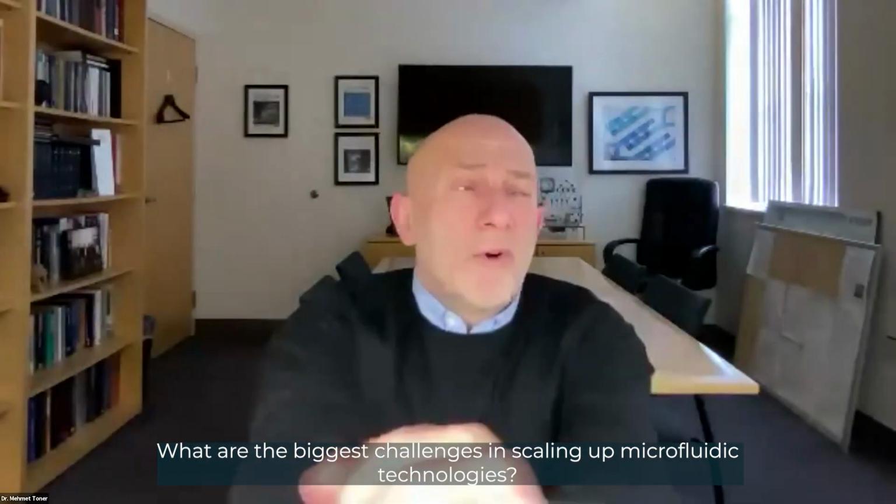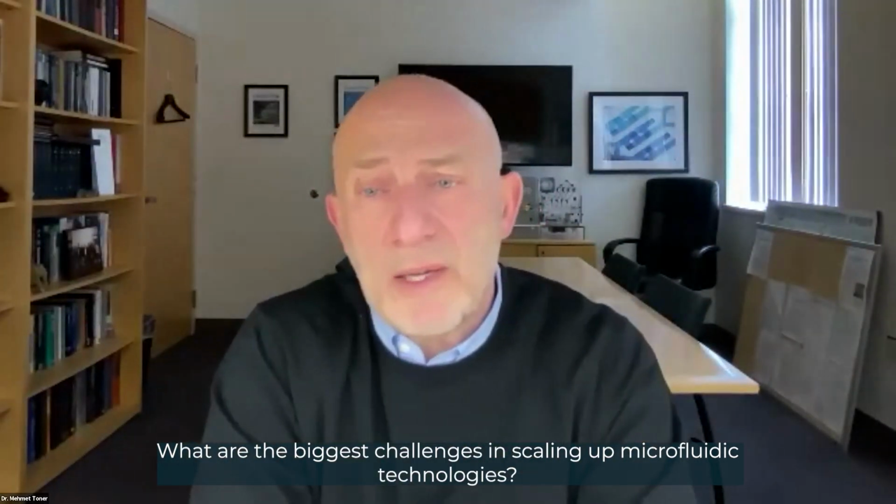Yeah, for example, the complex chip I showed you, the Stratec makes for us, it has about 4-meter channels in it, about several million posts that are the size of a human hair. There are about 126 or so parallel units for different functions, so on and so forth. And the reason why it's done in the circular CD shape is because it comes from the Blu-ray technology. They just didn't want to change the shape. Now they have modular other shapes too, but when we did this 7-8 years ago, the cost of that is very reasonable and it's not scaled to millions of chips.